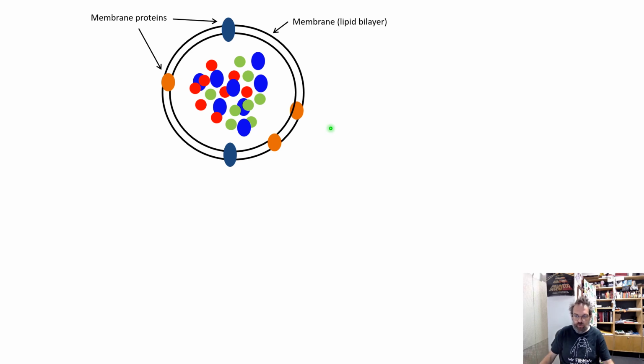You need to wash away all of those fetal calf serum contaminants, unless you basically want to profile the proteome of fetal calf serum, which no one wants to do.